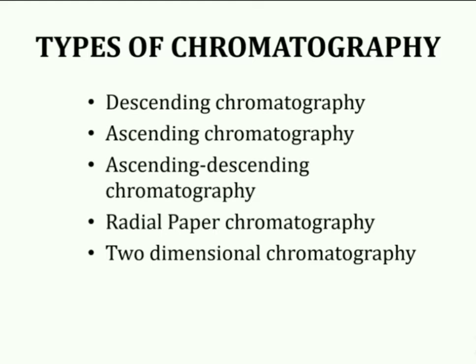Types of paper chromatography. Paper chromatography is divided into various types according to the method by which it is performed. Few of them are descending chromatography, ascending chromatography, ascending descending chromatography, radial paper chromatography, and two-dimensional chromatography.